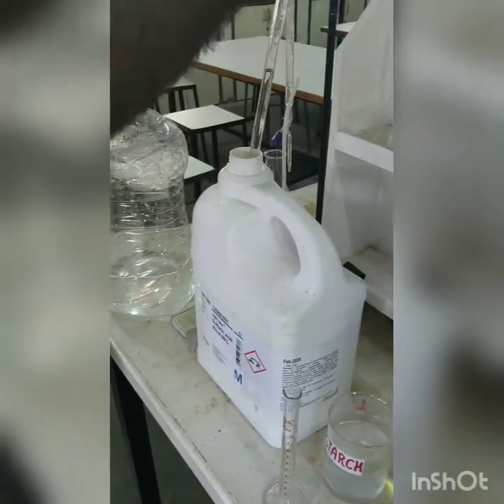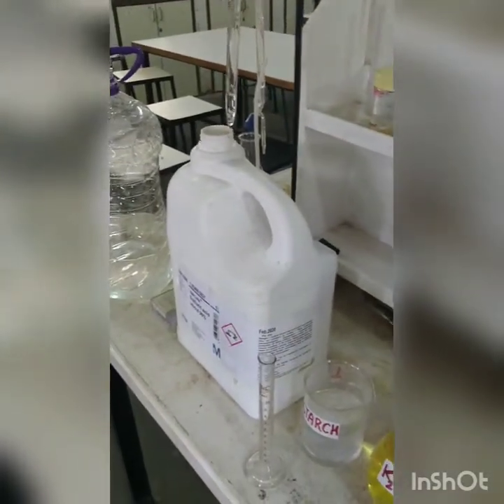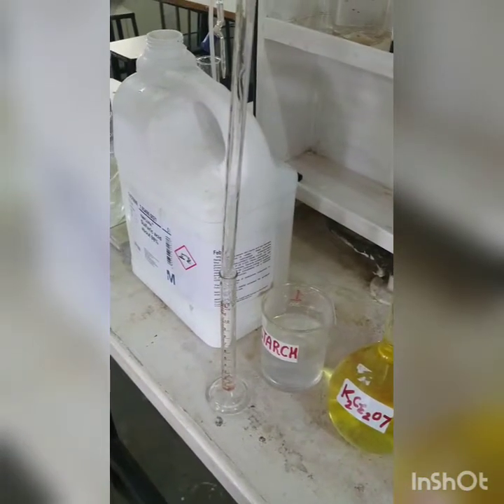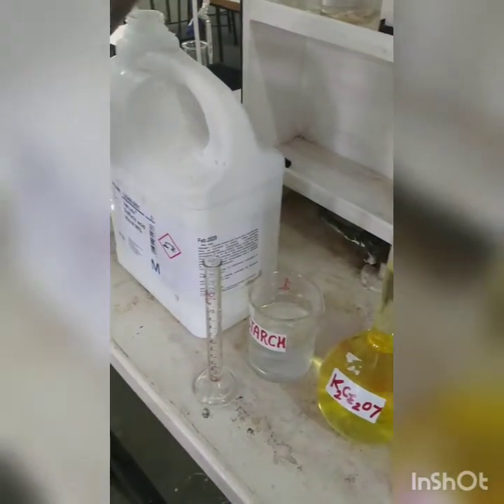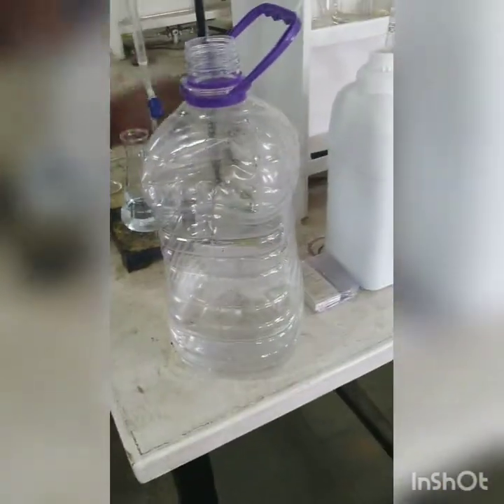Then he will adjust the level to 9. So from 9 to 10, this is a 10 ml pipette he is using. So adjust initial to 9. So you are not required to check it. Then put 1 ml. Okay. So 1 ml concentrated sulfuric acid has been taken. Now to this he is going to add 9 ml of distilled water.